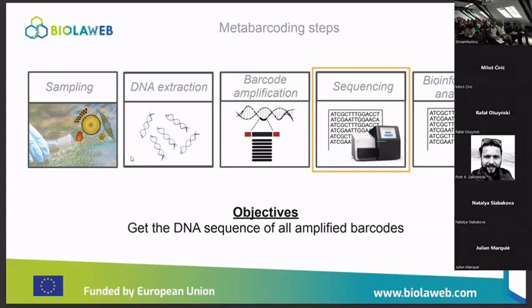I can imagine, for instance, if we would use some diatomite, so this stone made of diatom frustules, which is really like a filter. Yes, here it can be a problem if you have some DNA lost in this forest of frustules, but not when we are working on biofilms. It's the same for clays, for instance, that can also absorb DNA. So you have to add extra steps in your DNA protocols when you work with this kind of samples.